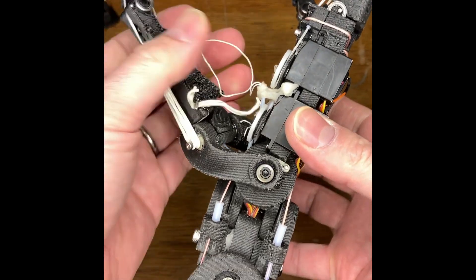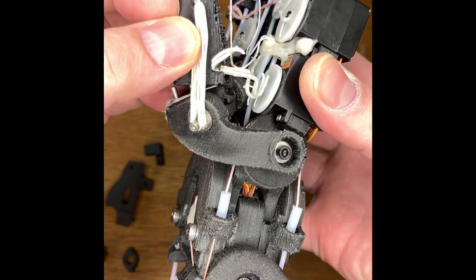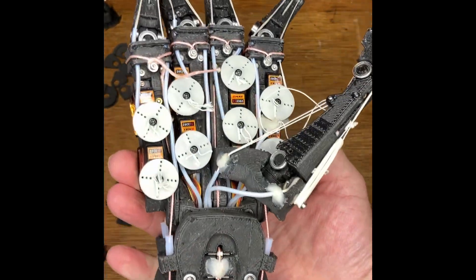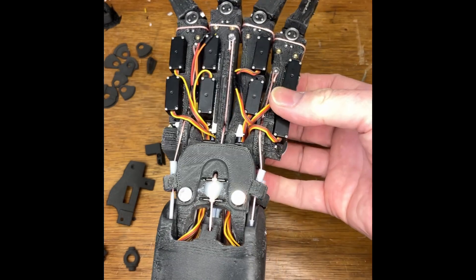The thumb elastics are all broken now — they used to pull it down. That needs to be fixed as well. So the v1 is a little bit incomplete, but it can be brought to a working state.